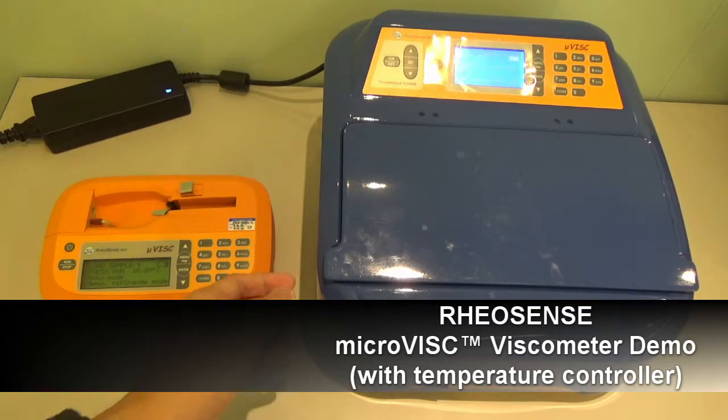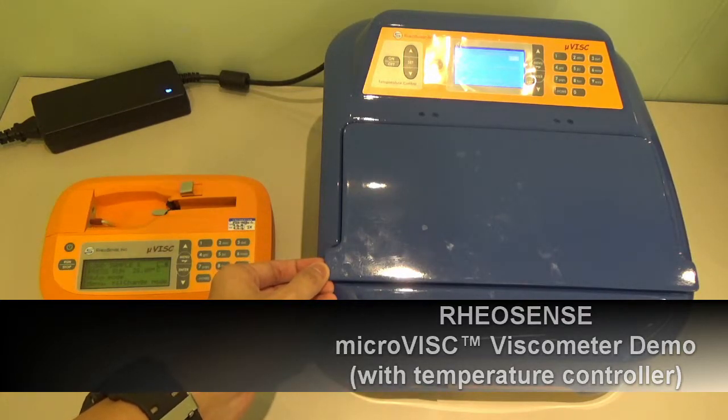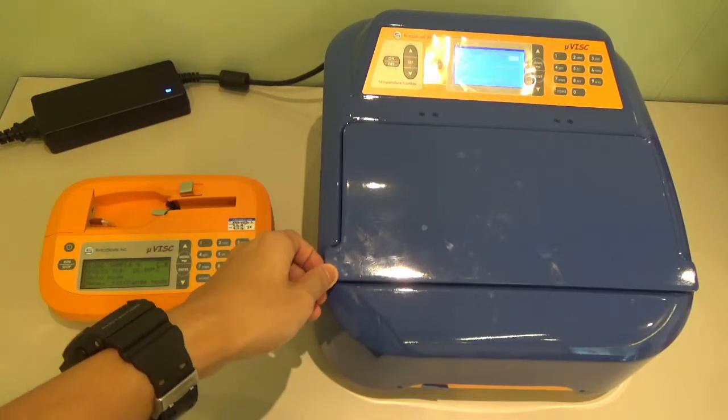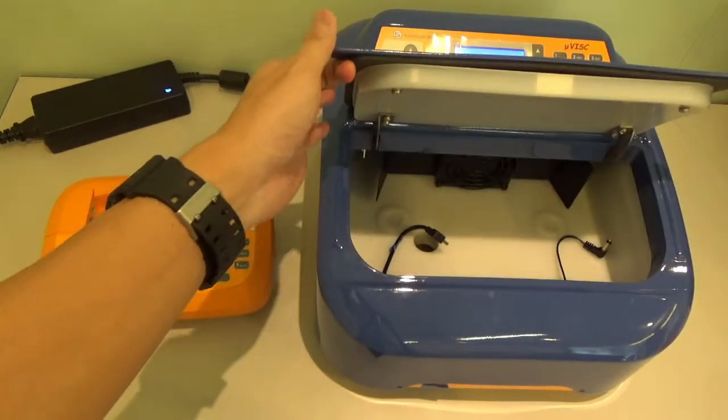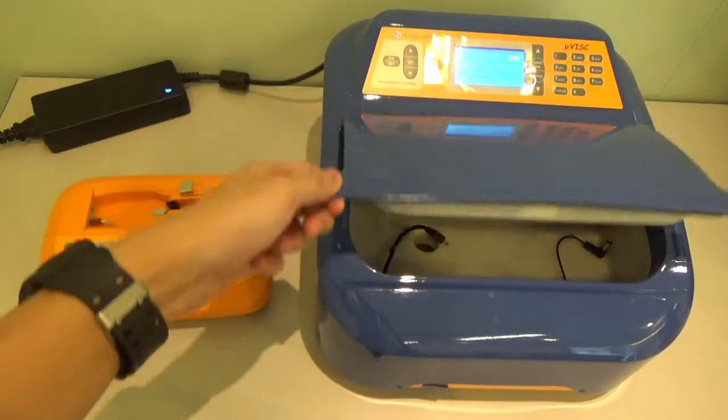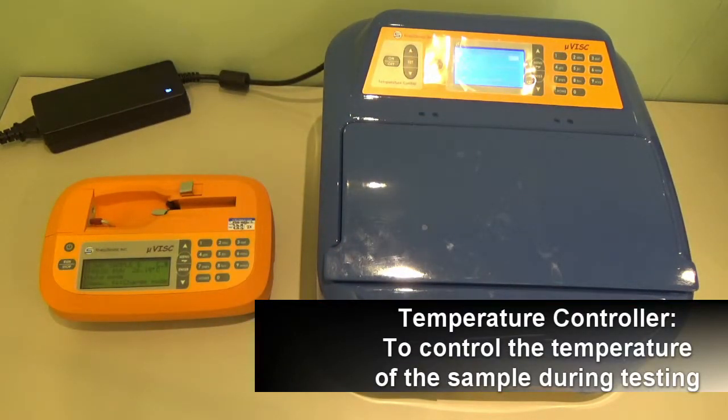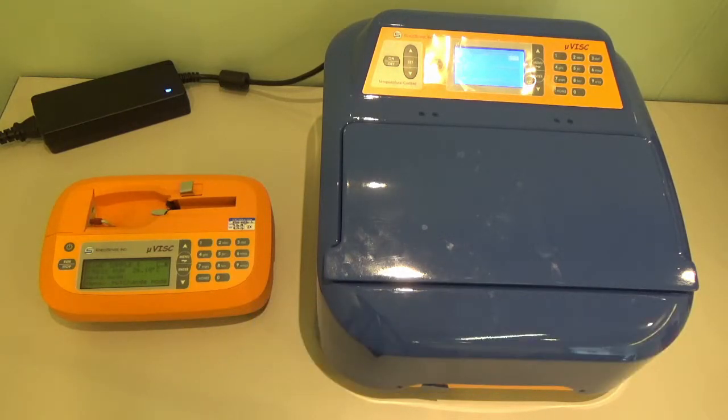Hi guys, today we have this additional temperature control equipment for the microVISC. Basically, the function of this unit is to control the temperature that you need during the running of samples, so you can control the temperature of the sample that you wish to run.